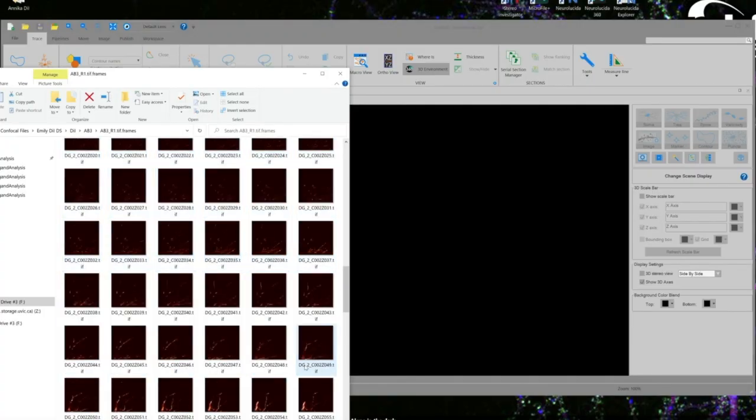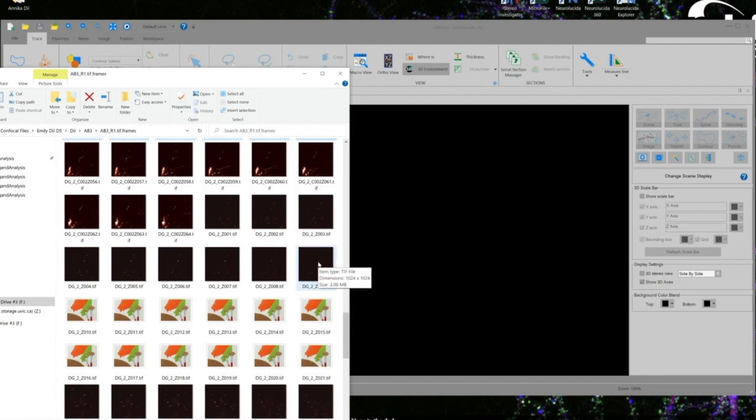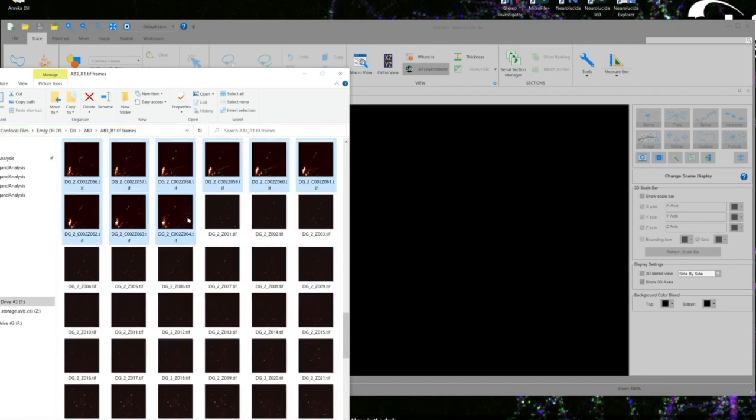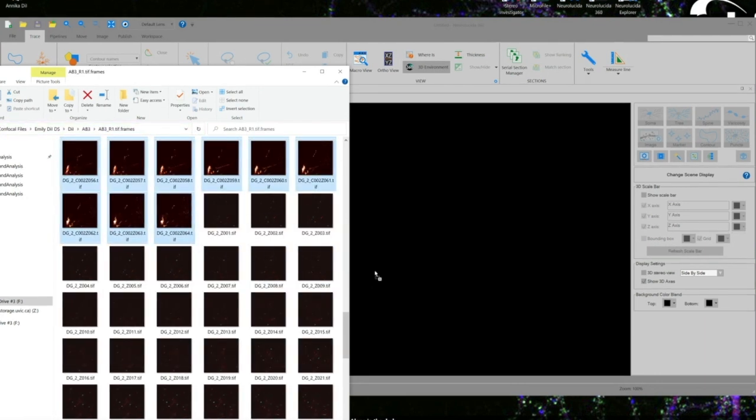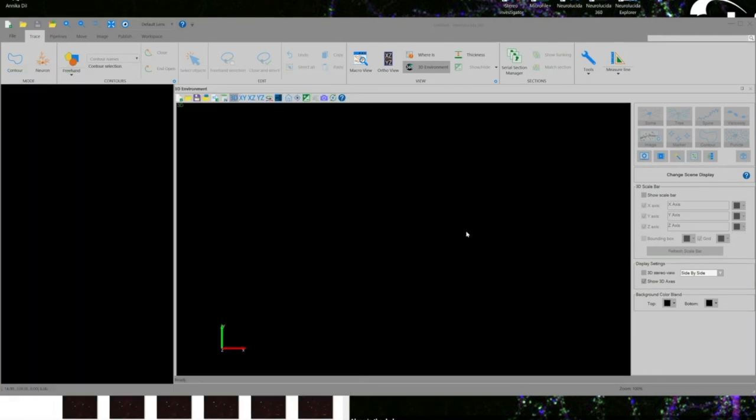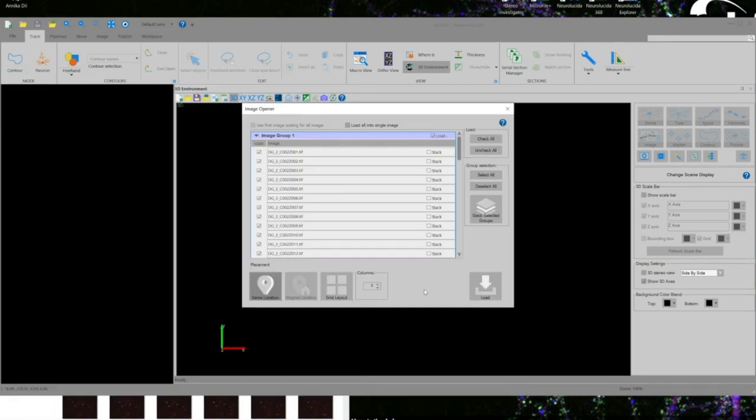After selecting all of the individual frames we want to turn into a merge stack file and dragging them directly into the NeuroLucida360 window, we will click select all, stack selected groups, and load.